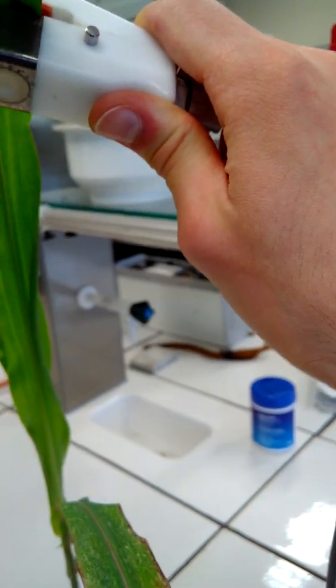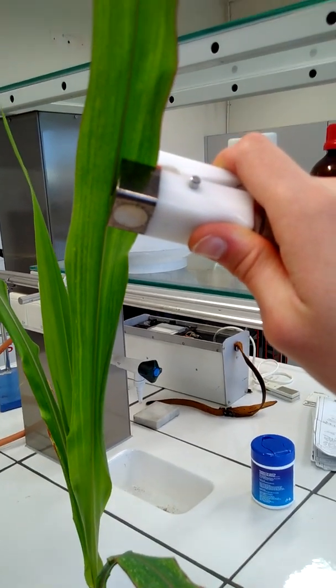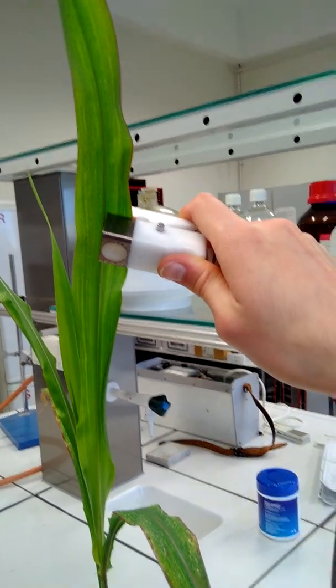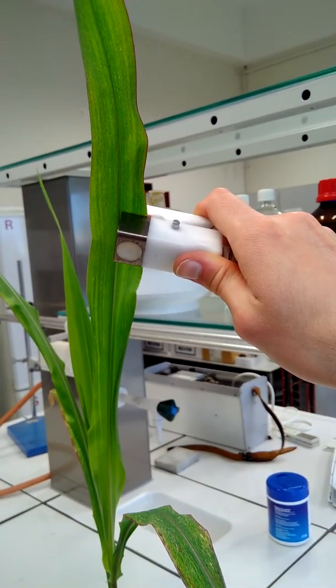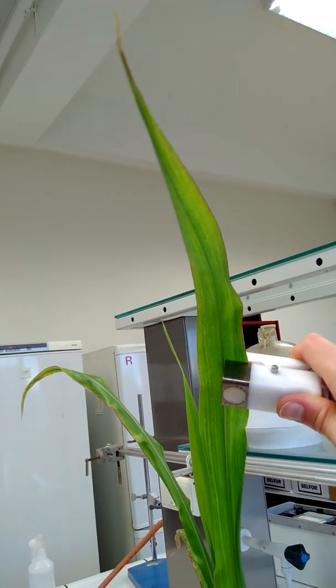But when I put it on the leaf, the leaf is more wet, and when some of the stomata are open to some extent, water will evaporate, transpire from the leaf into the chamber.